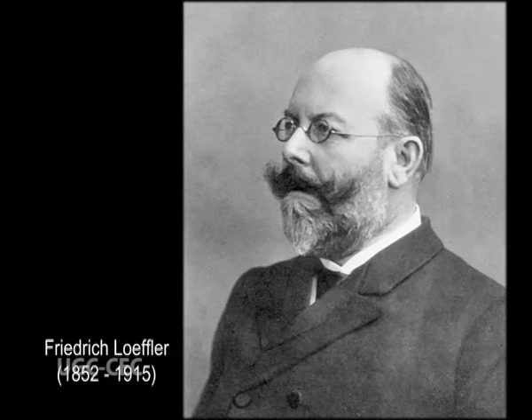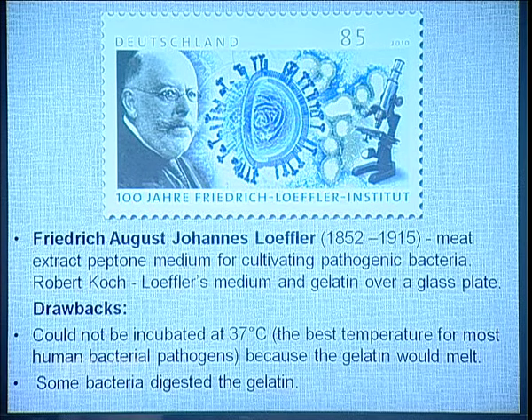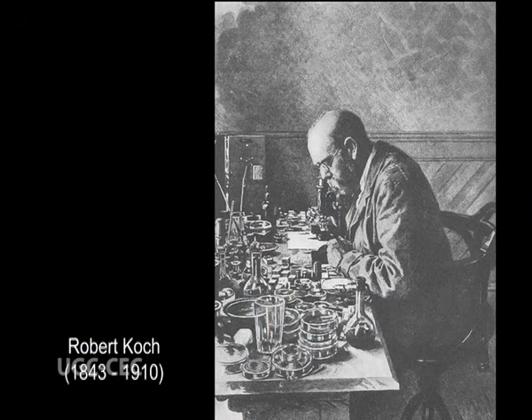Then we have Frederick Loeffler, an associate of Robert Koch. Robert Koch at this time was working with Bacillus anthracis, the organism which causes anthrax. Loeffler said let us make some solid media where this pathogenic bacteria could be cultivated. He came out with a meat extract peptone media. Now, Robert Koch took Loeffler's media and put some gelatin in it and observed that it gave a semi-solid state to the media. So, this was the first time he added something to a liquid media to prepare a solid media.